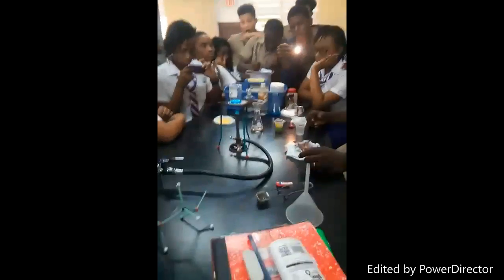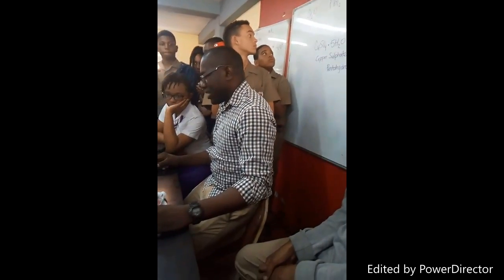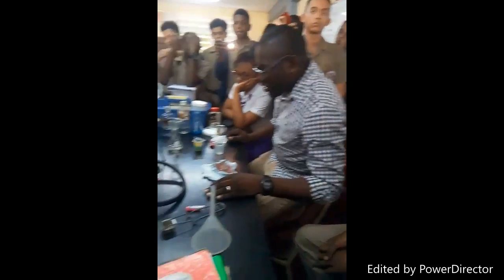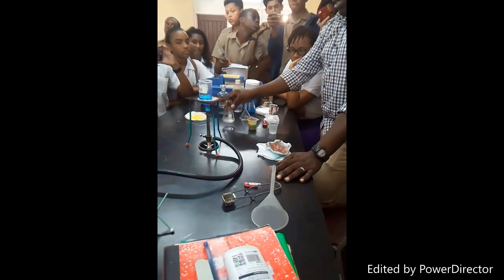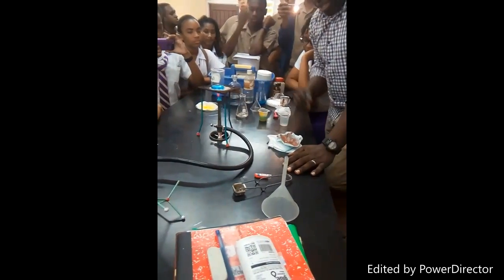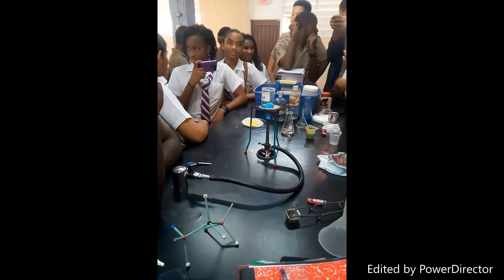Wait, sir. What's the filtrate? The filtrate would be the other salt, which would be potassium nitrate. We're not concerned about the filtrate. But if you want to see the potassium nitrate, you want to see it? Okay, fine. Since we have a little time. It's boiling.